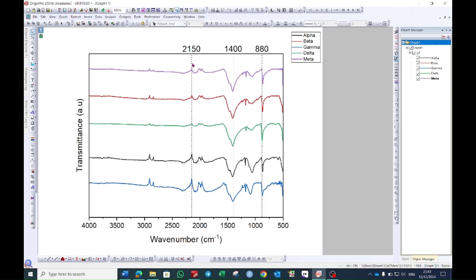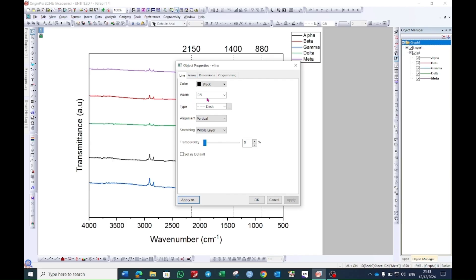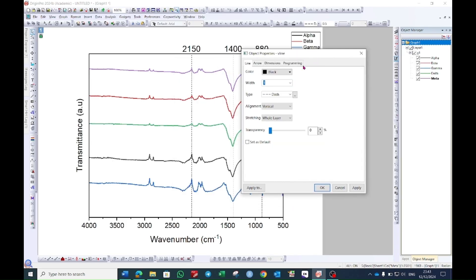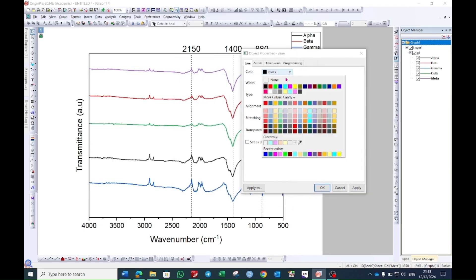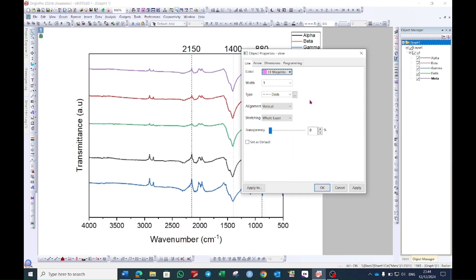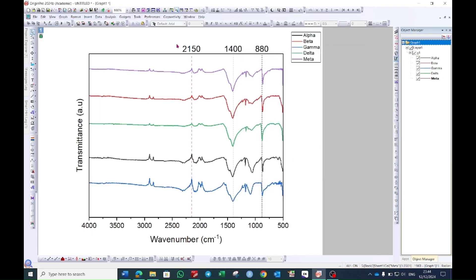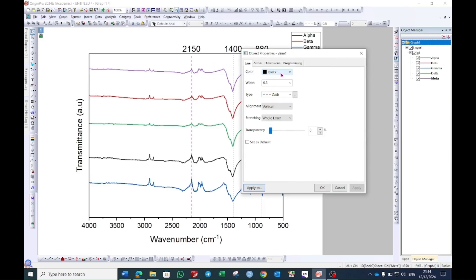You can also play with these lines. For example, you double click on this line and here you will see the width. For example, if you want to increase the width or if you want to change the color, for example, this pink one and then press ok. You can do this for the rest of the lines.